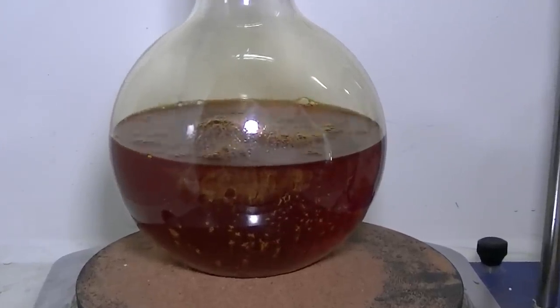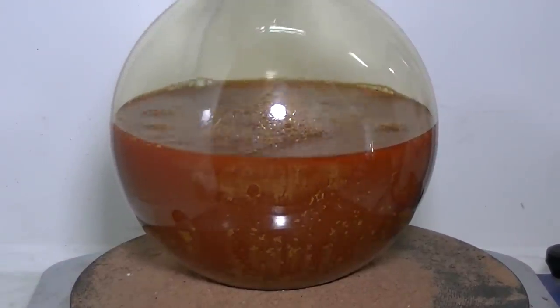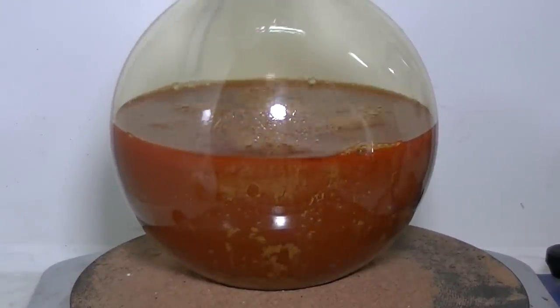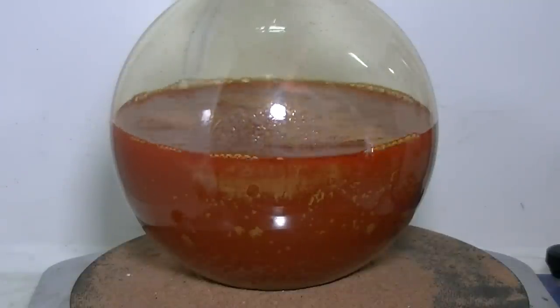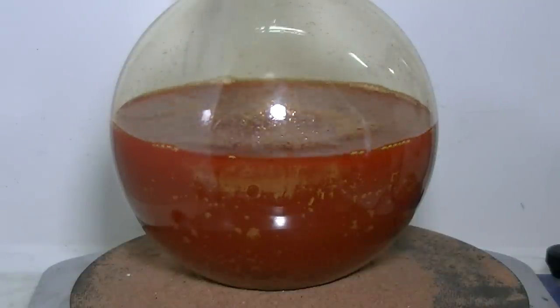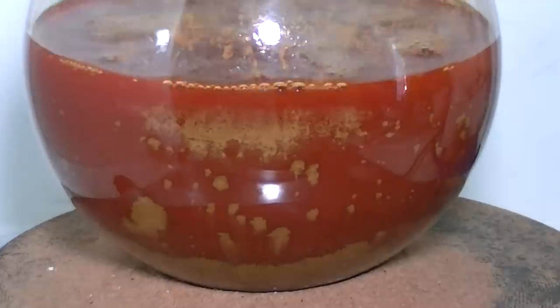This may take a while so let me fast forward. The main indicator for the reaction completion is the color of the solution. As I add more and more sodium hydroxide, the solution will eventually lose its red-orange color and turn into a brownish-black suspension, which is actually the gold being pushed out of the solution.